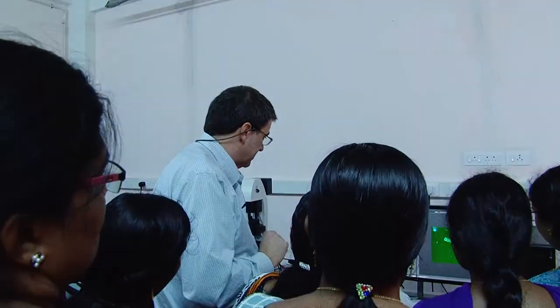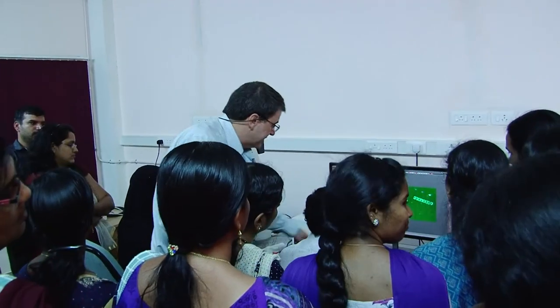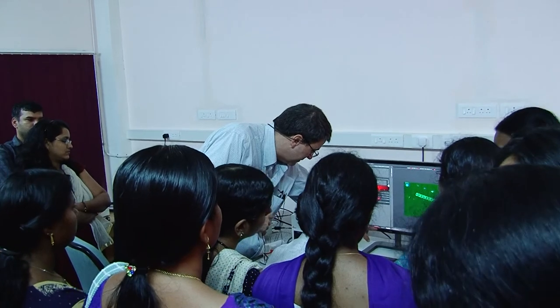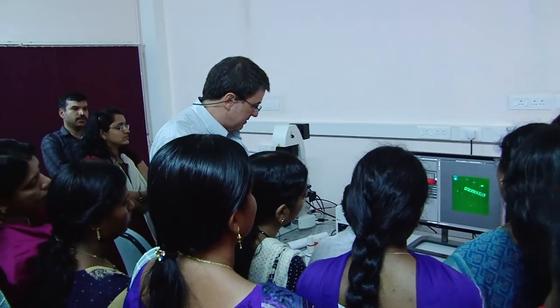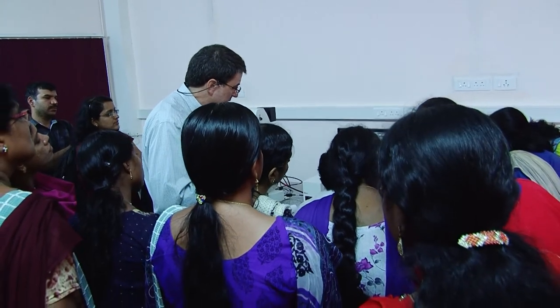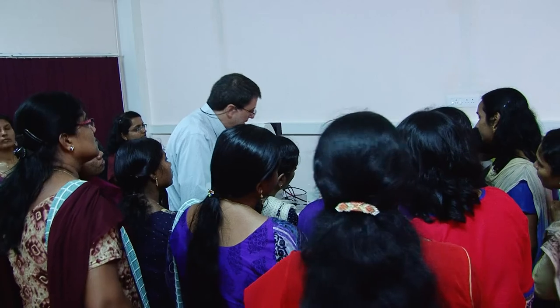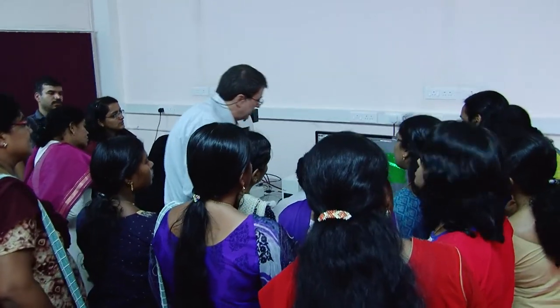Things fighting each other and things eating each other. It's pretty interesting. See, nice thing about this one, it tells you how long you got left. Like about 3 seconds, 2 seconds, 1 second. Okay, so show us how long that is. How long is that thing? See, this software has it built in based on the objective. Right? So that's 209, what is it, microns, right? And how wide is it?